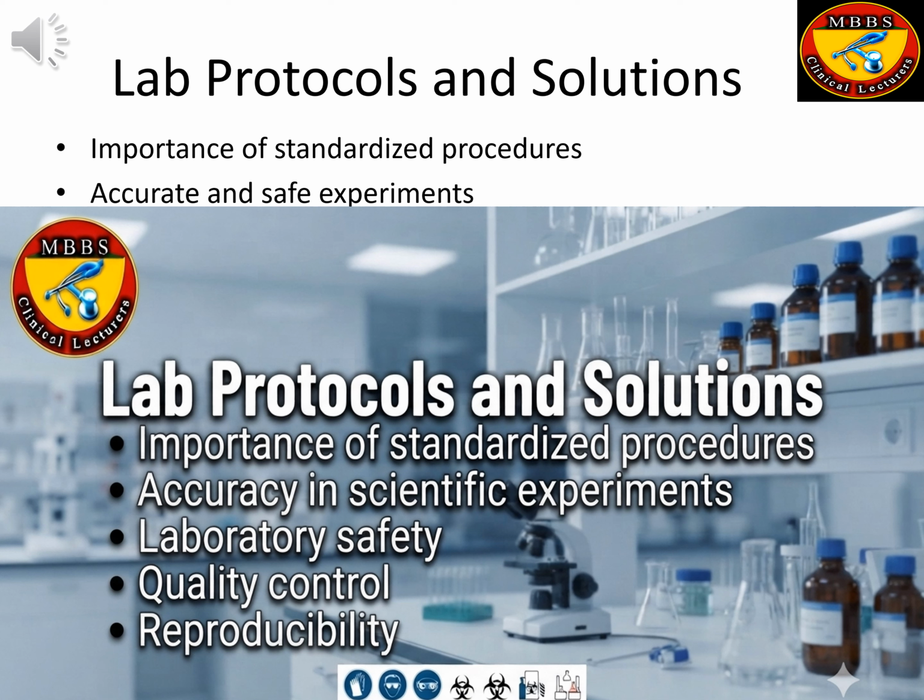Another important topic is laboratory solutions. A solution is a homogeneous mixture consisting of a solute dissolved in a solvent. Laboratory solutions are used in almost every experiment, including preparing culture media, staining tissues, extracting DNA, performing biochemical assays, and calibrating instruments. Proper preparation of solutions requires accurate weighing, measuring, mixing, labeling, and storage. Any mistake in concentration can significantly affect experimental outcomes.